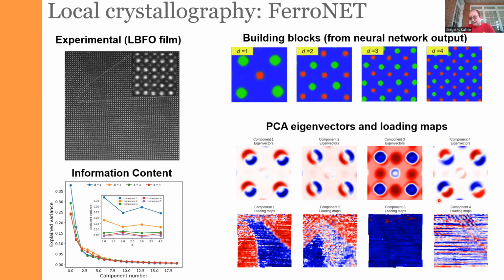In this case, look at the edges of these atoms. This is negative, negative, positive, positive, and this is positive, negative, positive, negative. So this component appeared because our choice of the feature is not ideal, and somehow it locked onto these edge effects. However, we can also figure out how important this component is. And you can see that basically this is already in the noise.